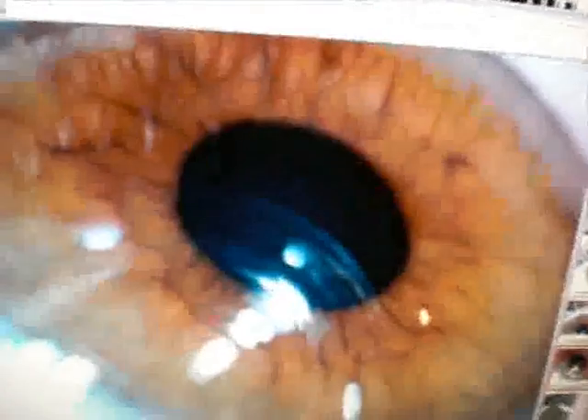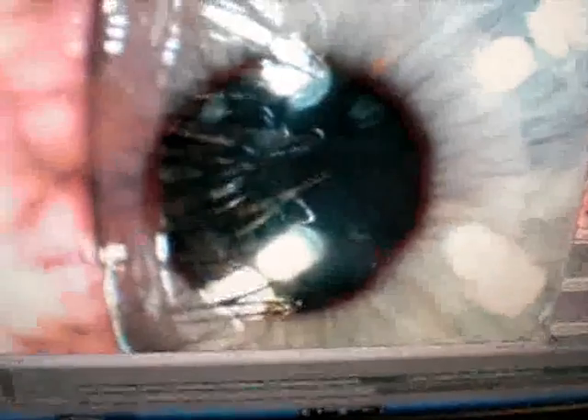We've had some fun. Ewww. I mean, the kids find it really interesting, you know, they love it. This is my chin.